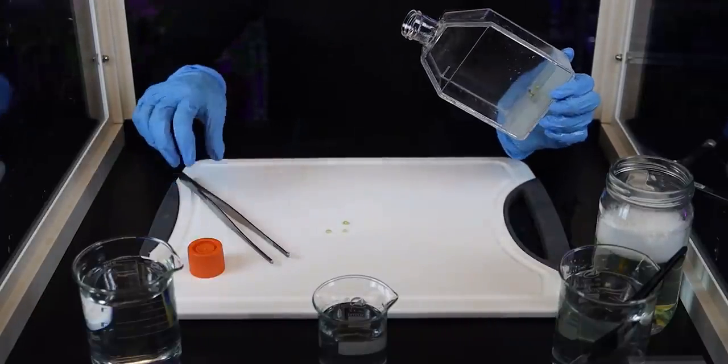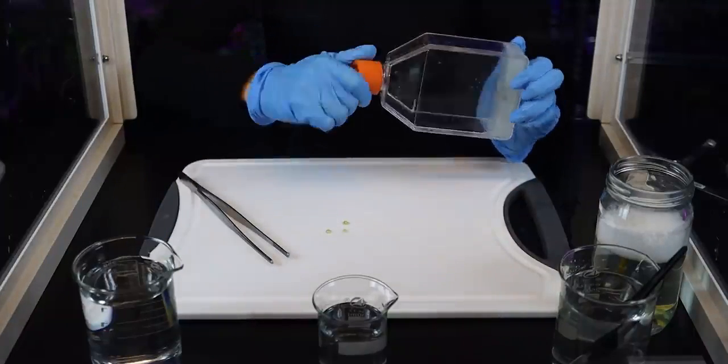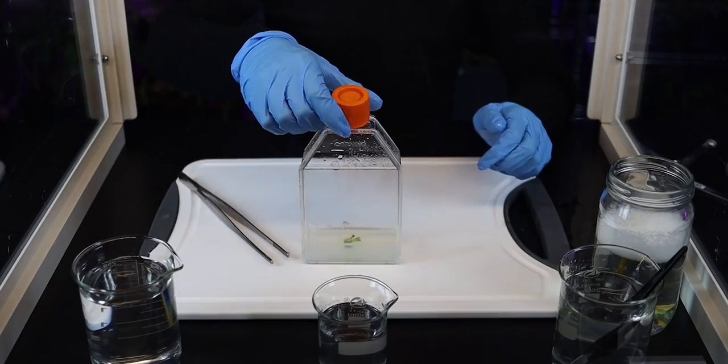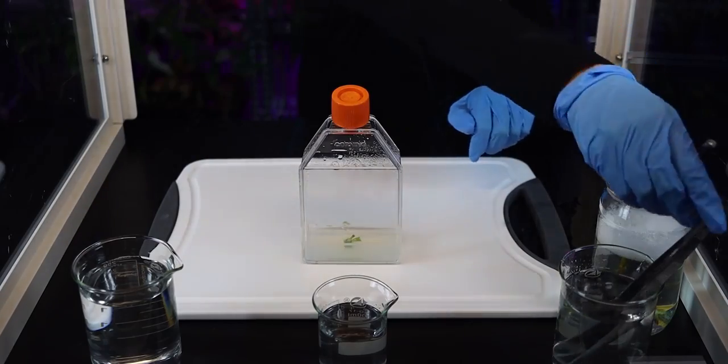Now that the plant material is inside the agar, I'm shutting the lid nice and tight. And there you have it! There is your prepped tissue culture plant.